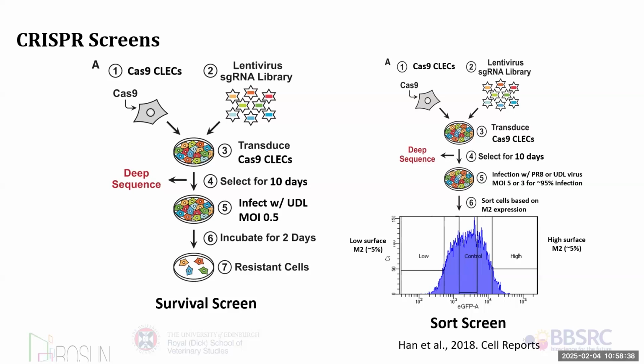I should mention the other things that I've put into the folder, as well as some of the files that will let us have a go at doing some of the analysis. There's a folder in there called protocols. That's basically got all the protocols that we pretty much use, written up. I don't know how beautifully they've been done, but they give you an idea. There are individual protocols for some of the different steps that you go through. So that should be a useful resource.